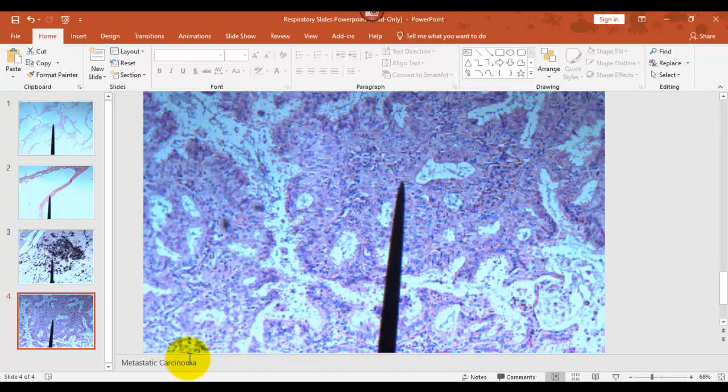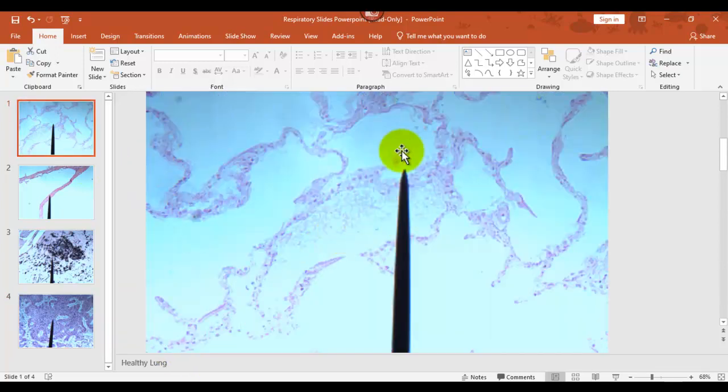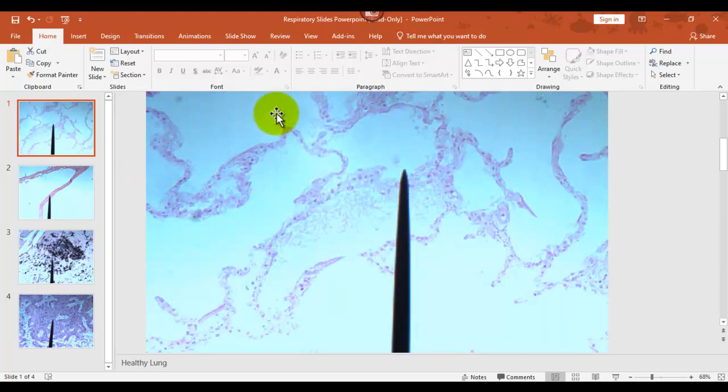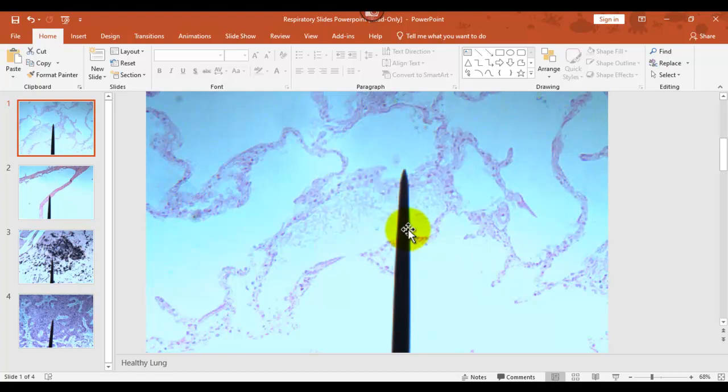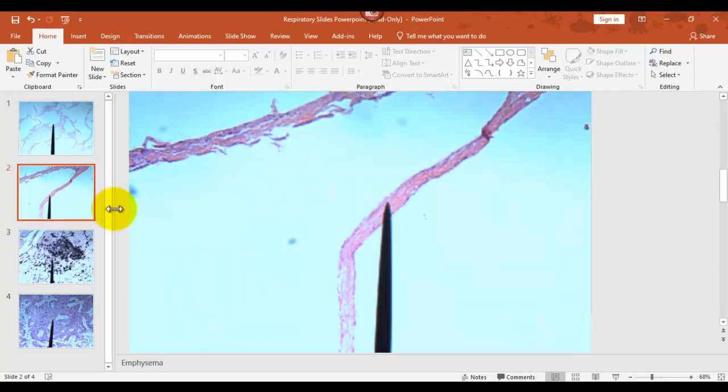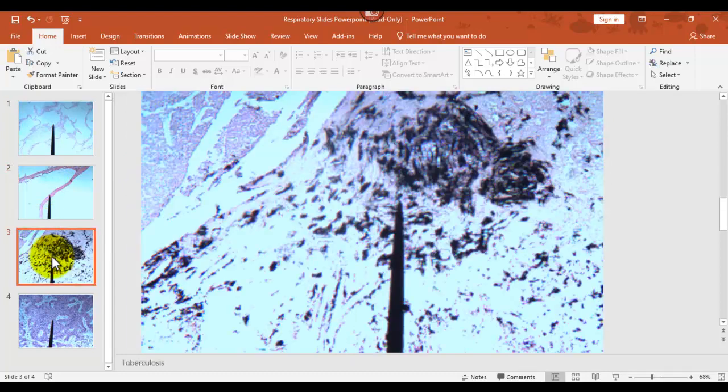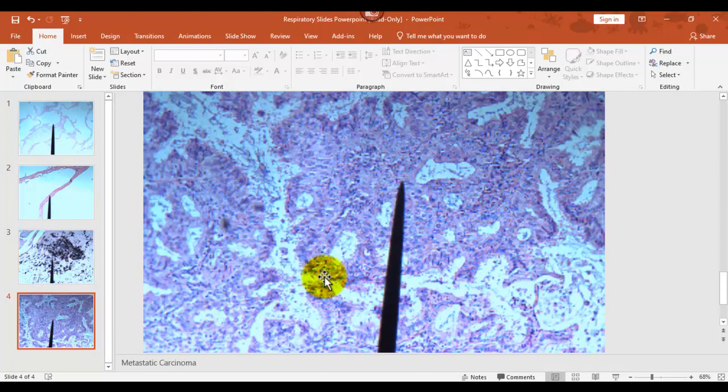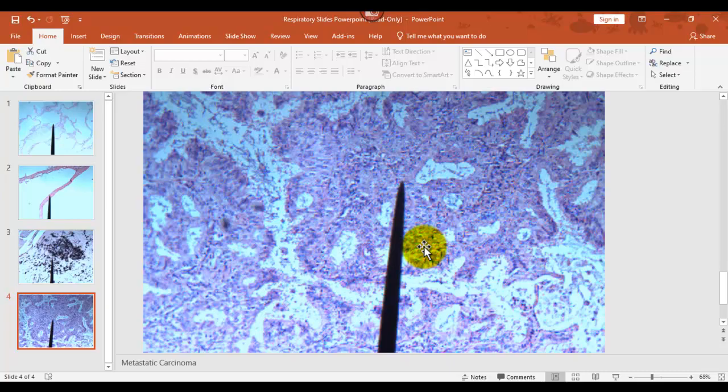So go back through one more time. So here's healthy lung tissue. Each of those little spaces is called an alveoli or an alveolus singular, but this is, you know, we're doing plural. This is emphysema. This is tuberculosis. And that is lung cancer. That's all the slides we're covering with the respiratory system.